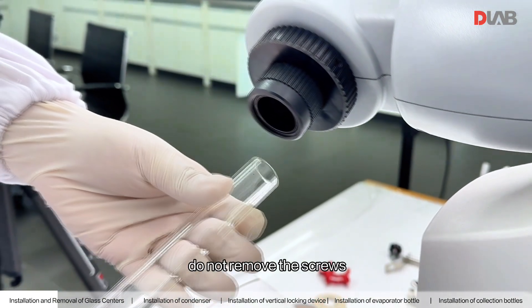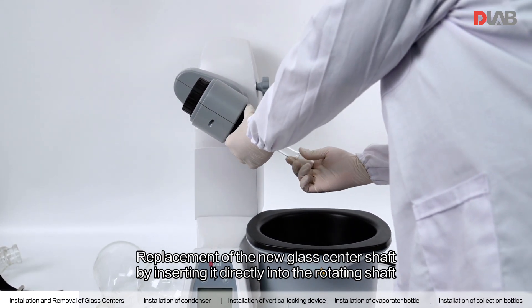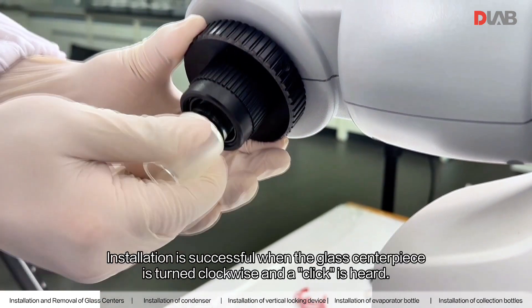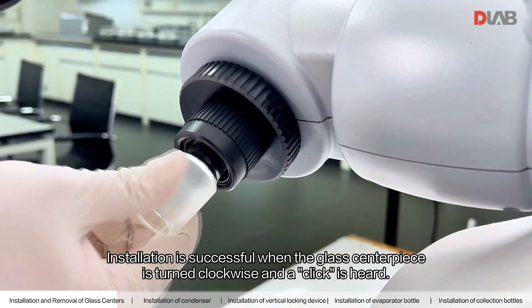Do not remove the screws. Replace the new glass center shaft by inserting it directly into the rotating shaft while holding the locking mechanism. Installation is successful when the glass centerpiece is turned clockwise and the click is heard.